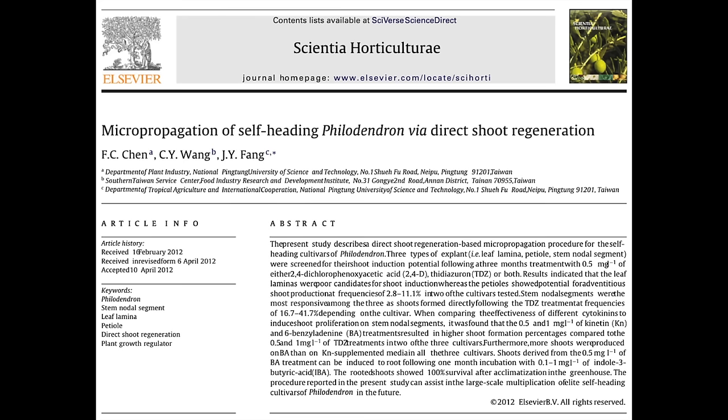Today we're going to tissue culture a philodendron mame, by following a protocol for philodendrons. The first step is to make the tissue culture media by following the instructions outlined in the protocol. There are four main components of tissue culture media, which is the gelatinous substance you see in tissue culture containers. Sometimes it's a liquid, but today we're going to be making solid media, which is the more common approach.